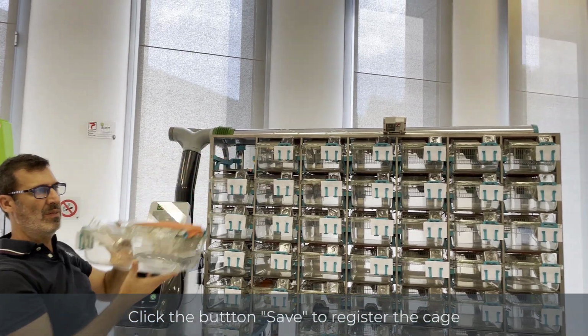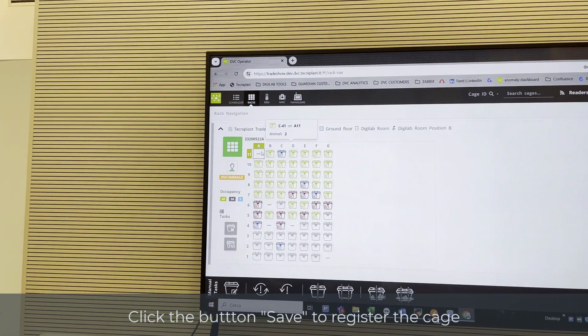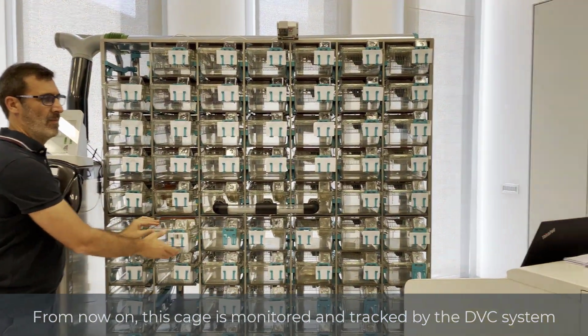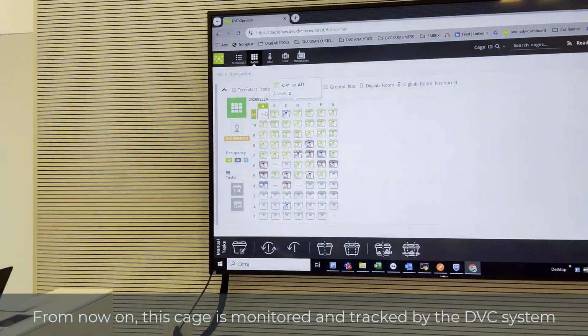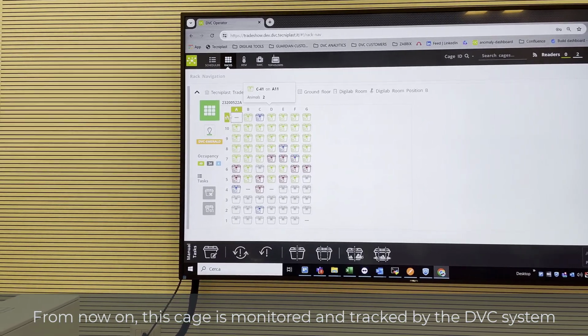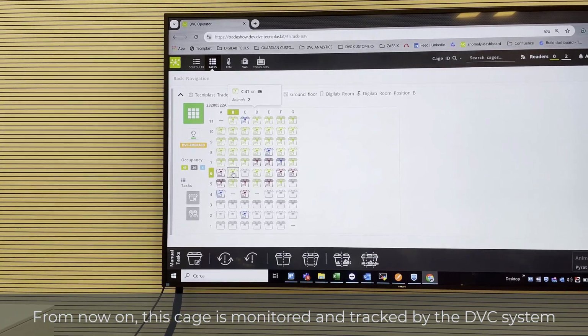When you remove the cage, it's also removed from the rack. When it is inserted into another position, it is appearing in the other position as well. This is the first way to register a cage.